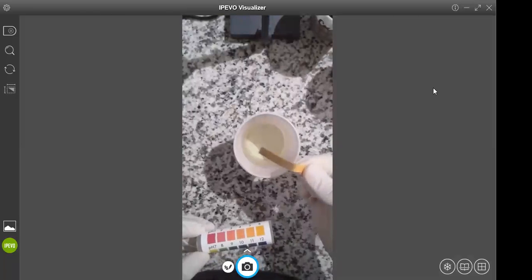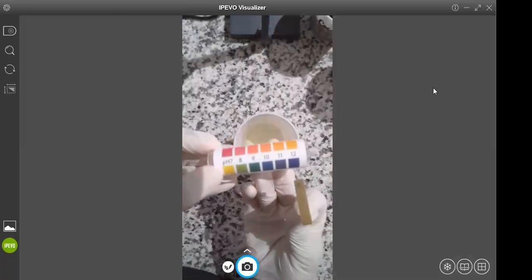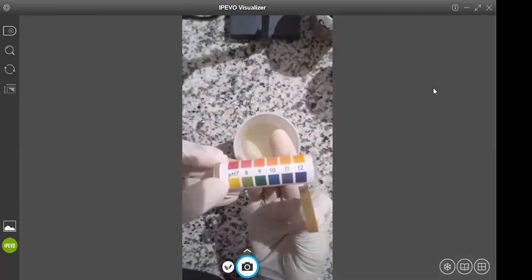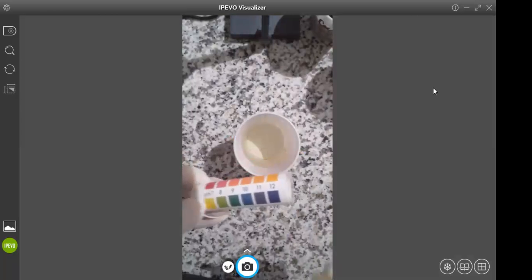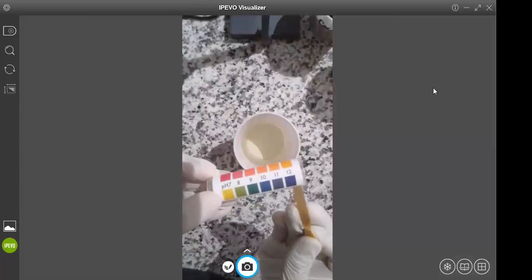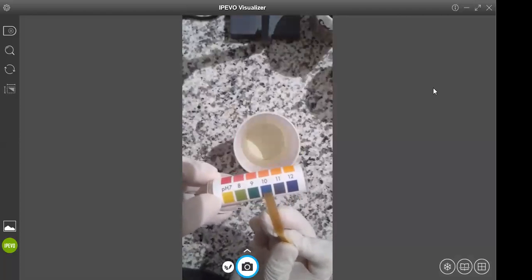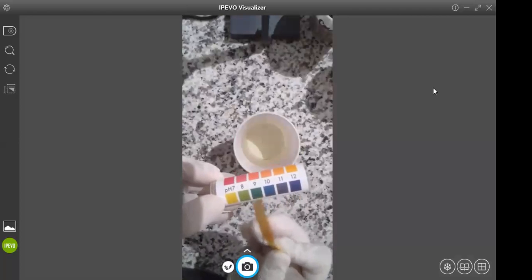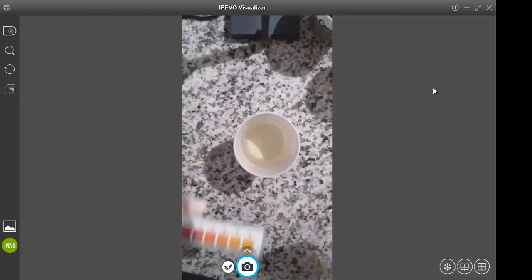It's quite dark, and actually the bleach is taking the color out of the darkness. So we're going to compare it to the dark side first before it all goes away. Is it a 12? Is it an 11? A 10? 9? 8? 7? And by then the color has already faded.